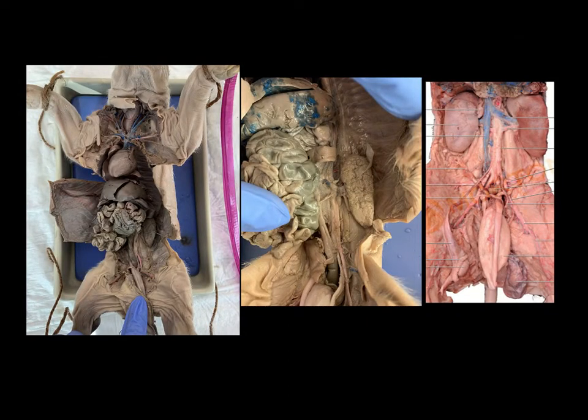Now, for the pigs, that's all the veins that you have to know. So next we're going to look at arteries.